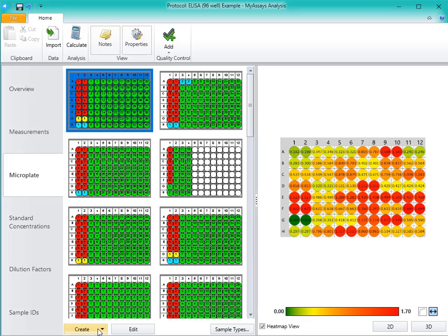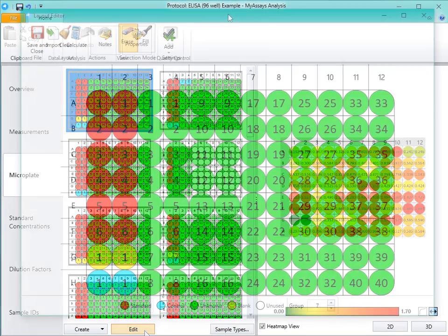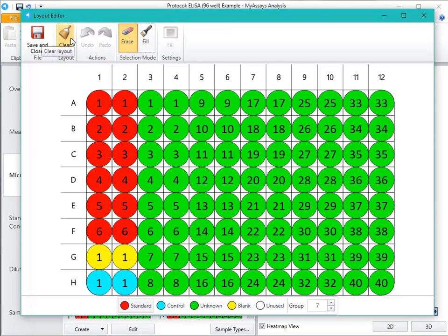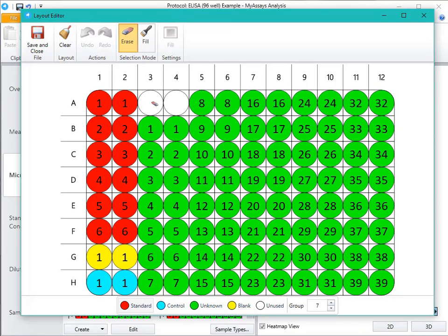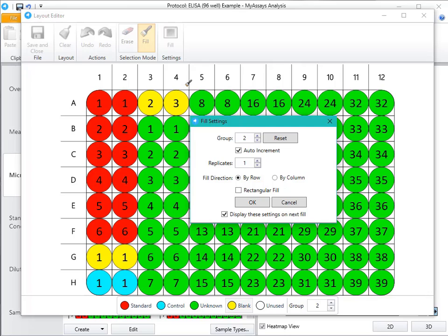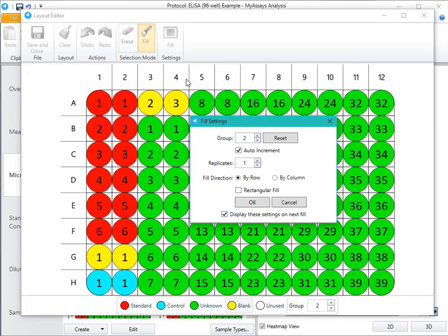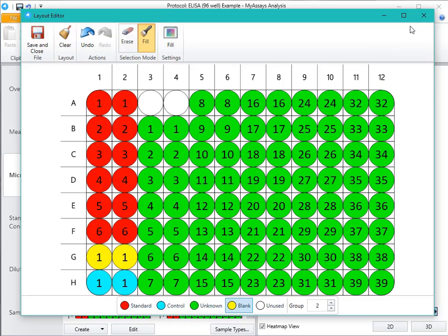You can also manage the sample types used in the assay by clicking the Sample Types button. If you choose to edit or create a layout, the Layout Editor will open. You can clear the layout, erase specific samples, and fill with samples of your choice. For more information on how to use the Plate Layout Editor, please see the additional video on that topic.